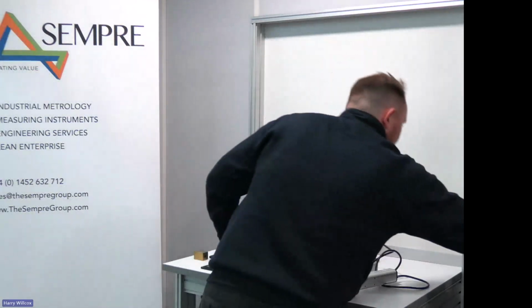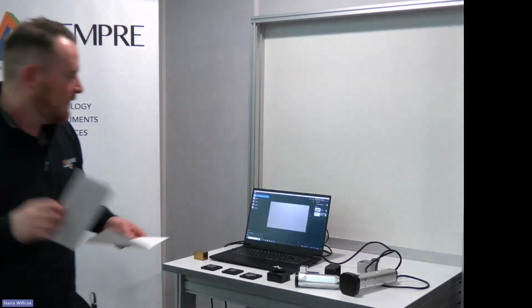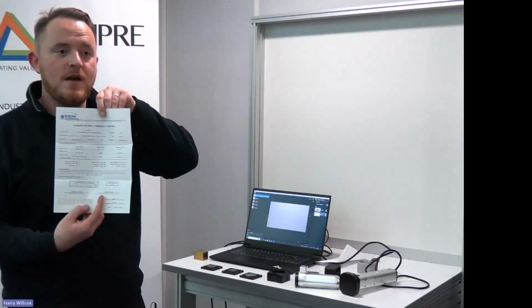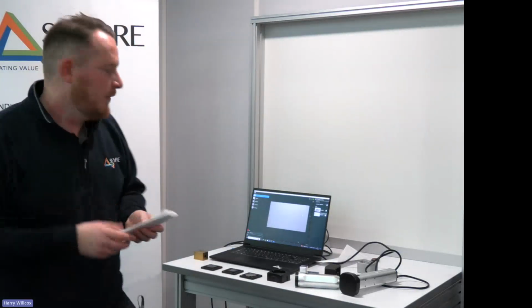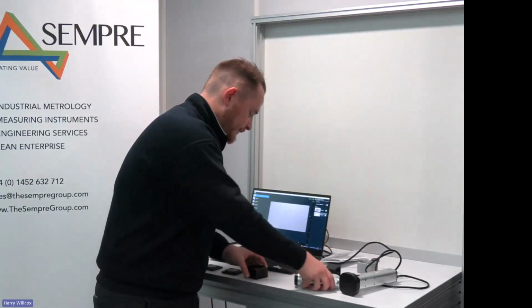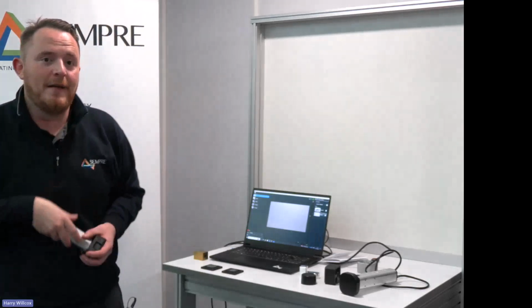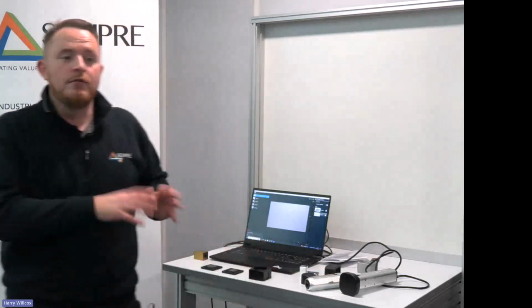Within the software, we input a value which comes from our calibration certificate for the system. It comes with a sheet, and there's a number down here that we input into the software. When we calibrate, we take that final scan on our G500, which is effectively the same as the other ones. We take our sensor and take a scan. What that's doing is measuring the depth of that flat bottom slot, and we output a deviation to the known number.